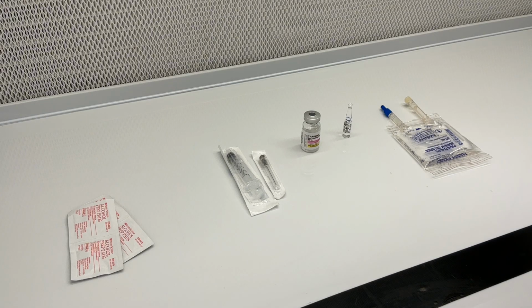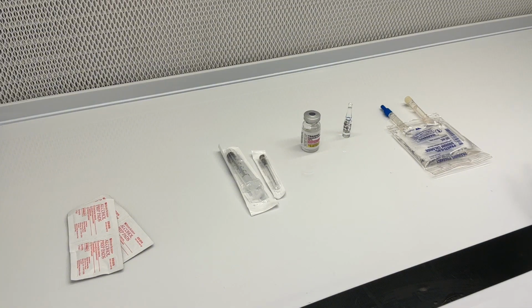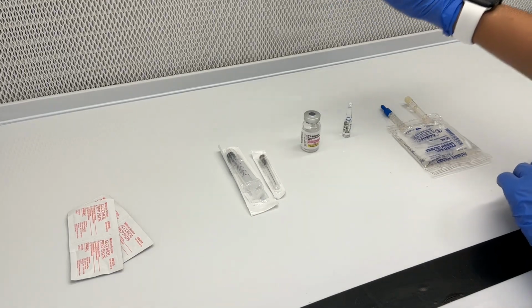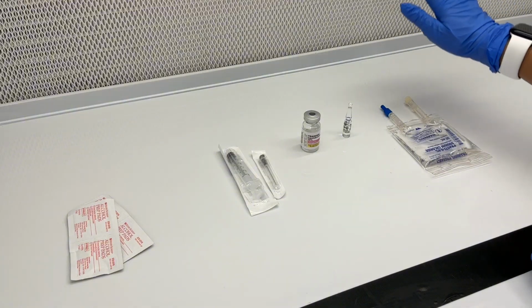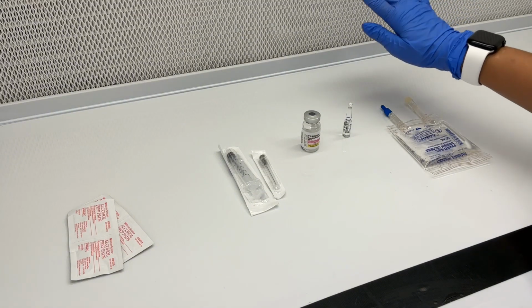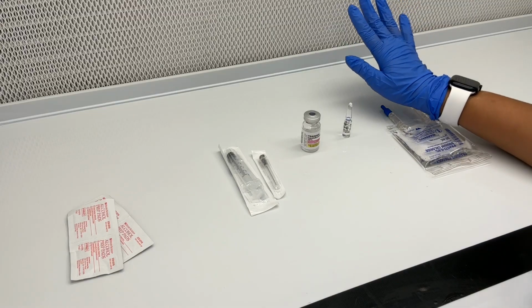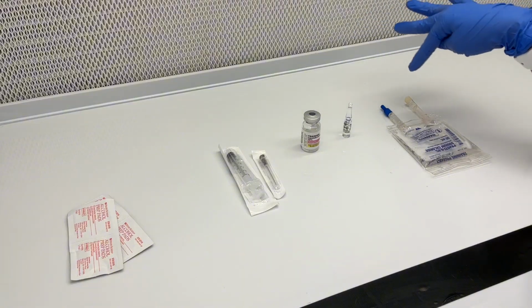When it comes to placing things inside of your hood, you want to make sure that your critical sites are in first air. Now, what first air means is that your critical sites are not being blocked by another object and that they are able to receive the airflow coming from this back filter. This back filter is called your HEPA filter. Your HEPA filter filters out the air from your environment, free of bacteria, free of dust, free of pollen, and it pushes anything that's settling onto your critical sites.